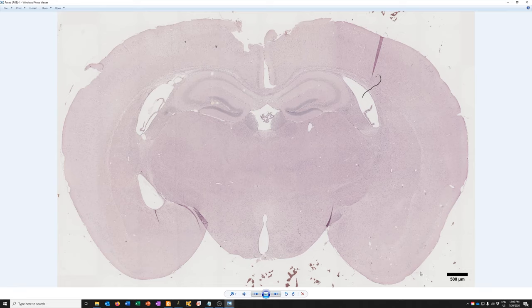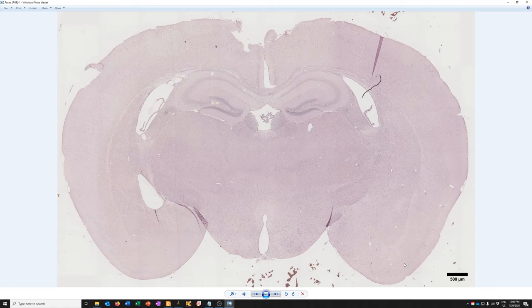So that's how you stitch images that you've acquired using the tiling mode on the iX81. As always, please let me know if you have any questions.